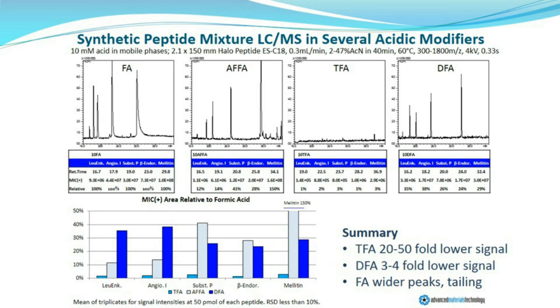That is, the selected ions obtained for each charged state of each of those peptides. So this is a more reasonable means to integrate that data because it includes all charged species for each of the individual peptides. Those are then summed and then compared across the 4 different mobile phase conditions.